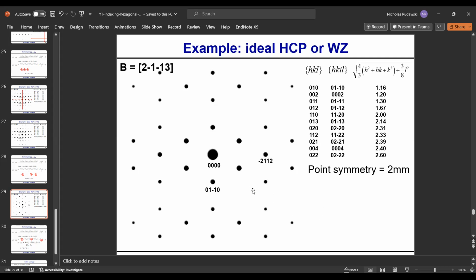And then so now, just like before, we can do a little vector math. Spots are spaced a little bit more generously here, so we can navigate this a little bit easier. 0, 2, 0, yeah, like that. This is half of the distance, I should say. Then I'm just taking opposites here.